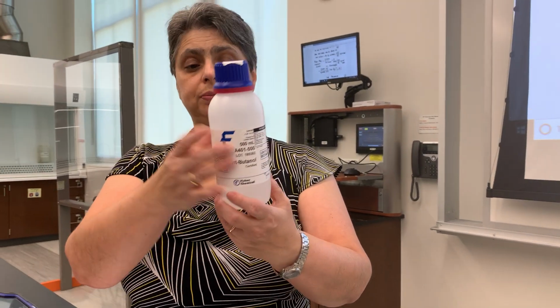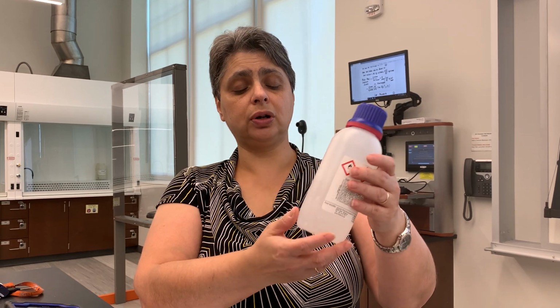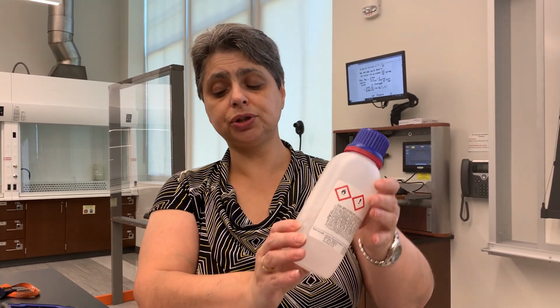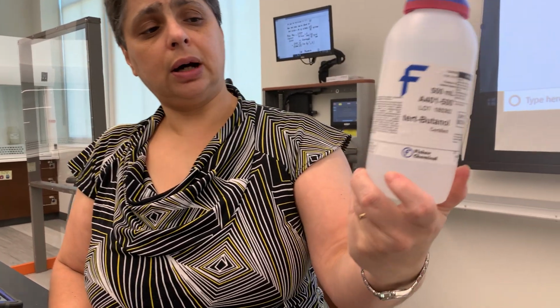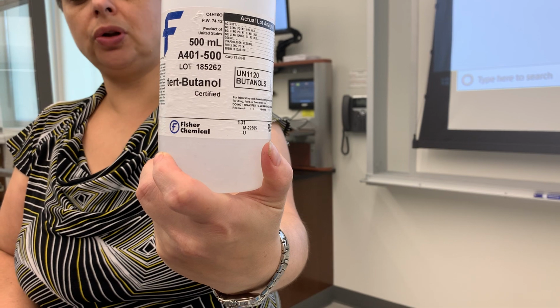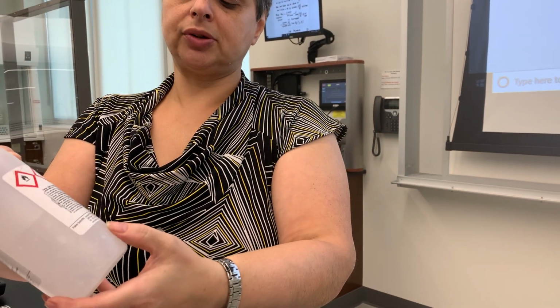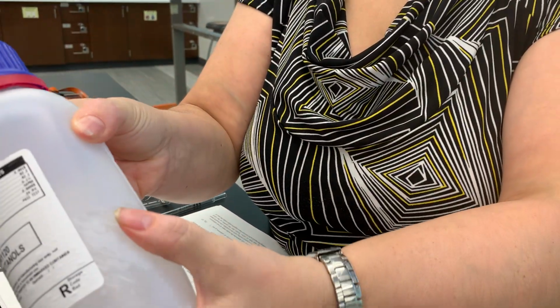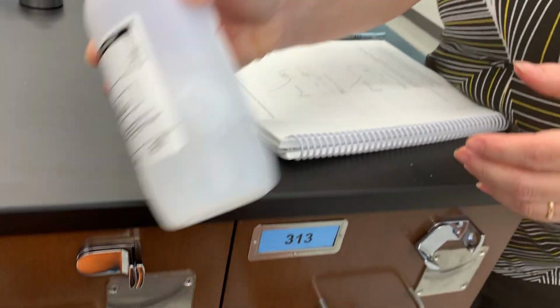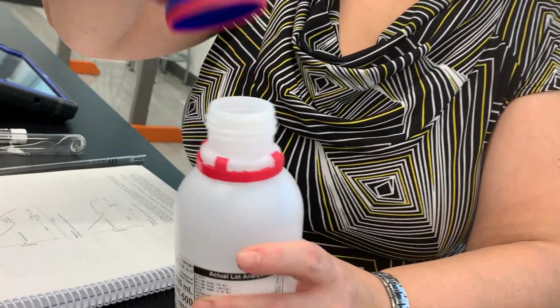This, of course, being a liquid, would be expected to be in a bottle, and it is, but I'm not sure if we will be able to show this to you. I just went and grabbed this off the shelf in the prep room, and hopefully you can see it says tert-butanol. But the interesting thing about this substance right now is it's pretty much completely, totally frozen. I'm gonna open it and we'll see if we can peer inside the bottle.